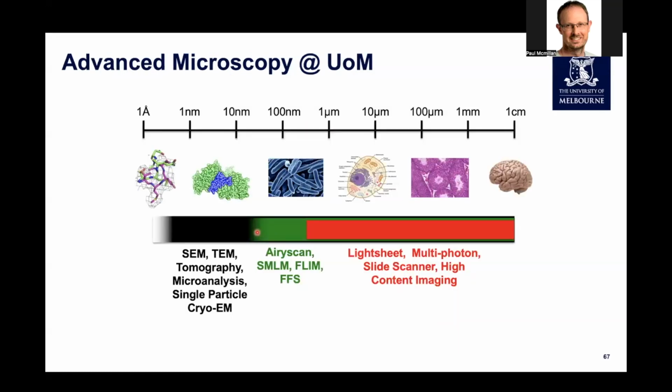All right, so we've been through quite a lot, and apologies for not sharing the screens on the first half of that. As I say, I'm happy to share the slides so you can go back through that content. So hopefully you can see how we can use fluorescence microscopy approaches to image samples all the way from organs, small model organisms, through tissues, through cells, through organelles, down into the molecular level once we go past that diffraction limit. As I mentioned, once we get beyond the 20 nanometer resolution, then we need to move into some of the electron microscopy applications.